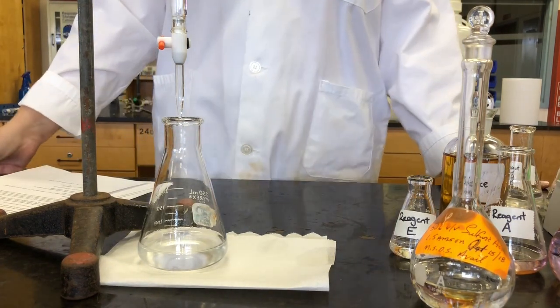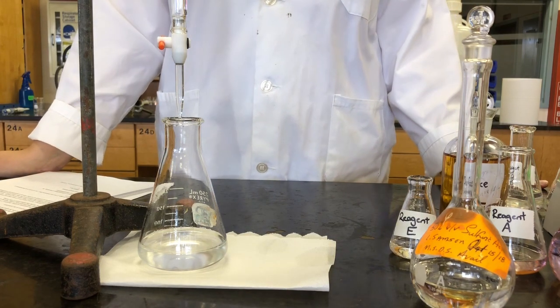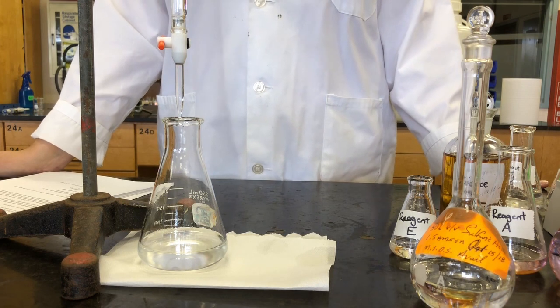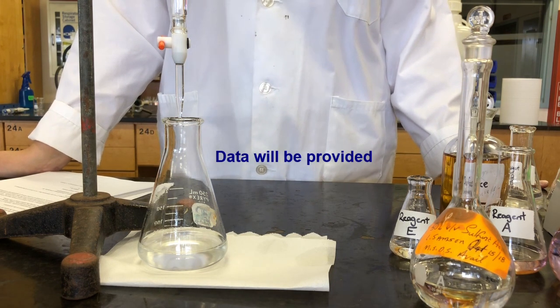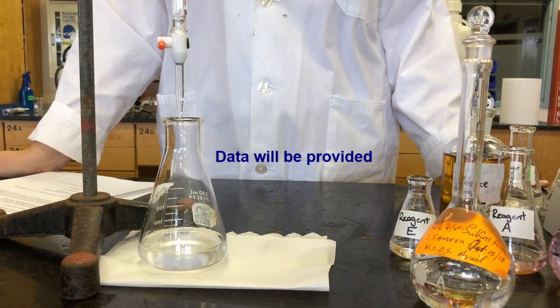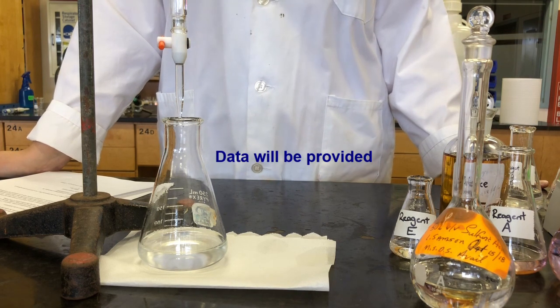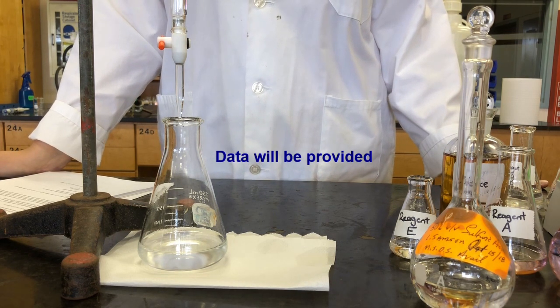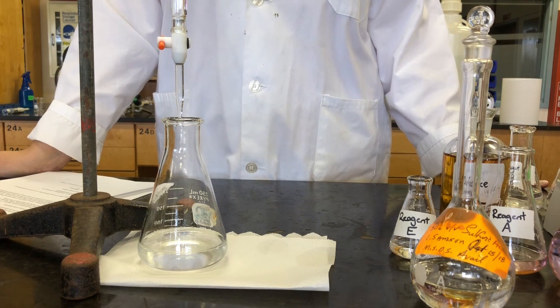So the volume of our titrant that we used there, our sodium thiosulfate, we're going to use that in our calculations to determine how much iodine is in the solution, and that in turn can be used to determine the amount of dissolved oxygen in your sample. Okay. So again, you'll be provided with the results for the rest of the samples, and for any replicates that you do. And then next week we're going to come back and test the samples for the biological oxygen demand.